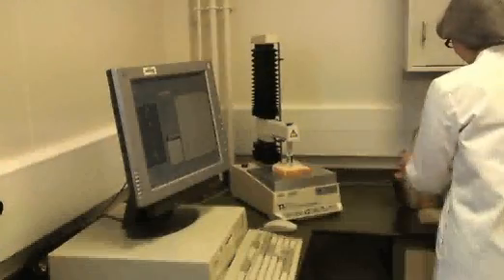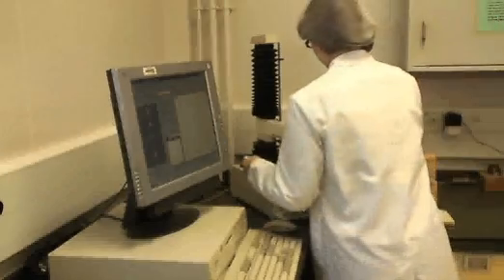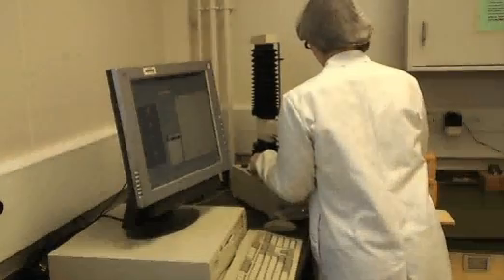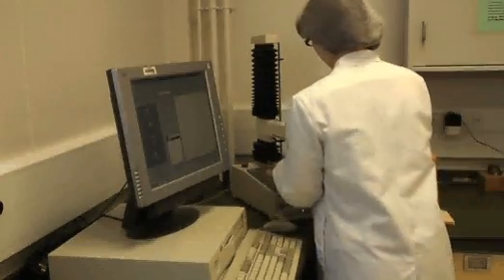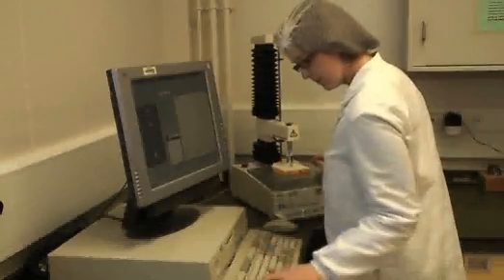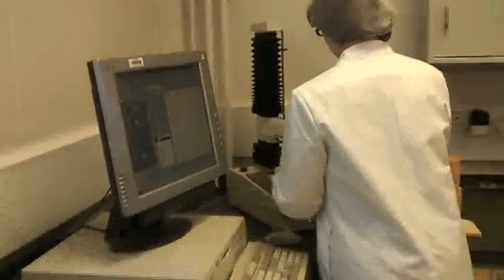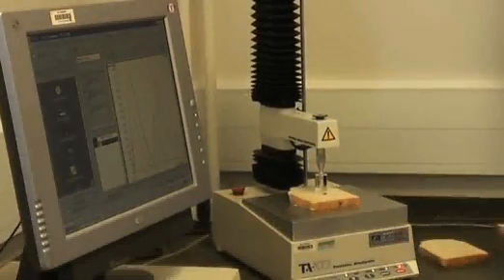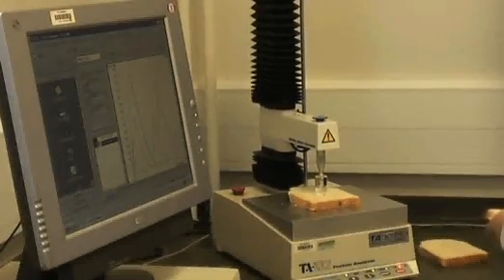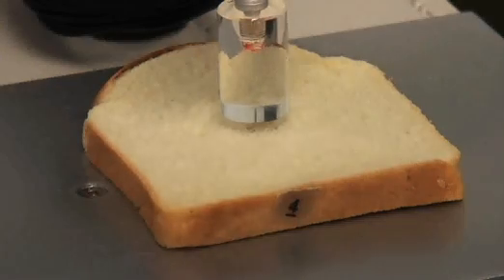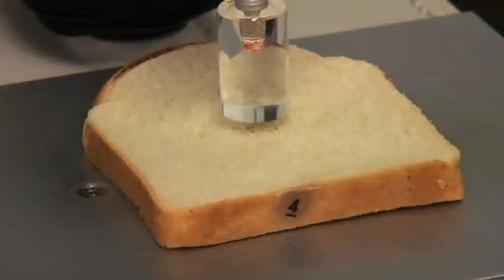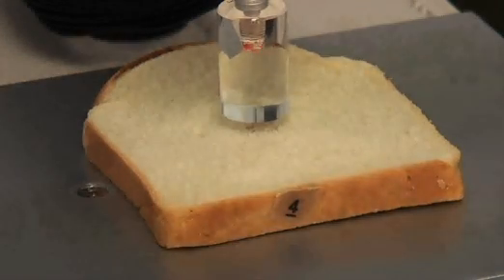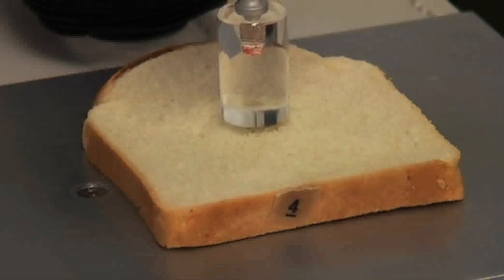Another important element is the overall softness of bread, and again an objective technique called texture profile analysis is used to characterise the softness. In addition, it also gives us information about the resilience of a particular loaf, which is always important in relation to the butterability of a particular slice of bread.